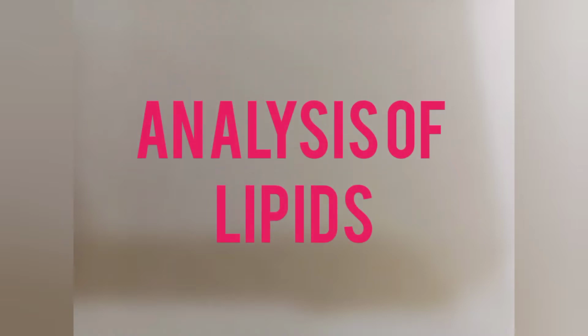Analysis of lipids. For our objectives, to investigate the lipid composition of common foods such as corn oil, butter, and egg yolk.